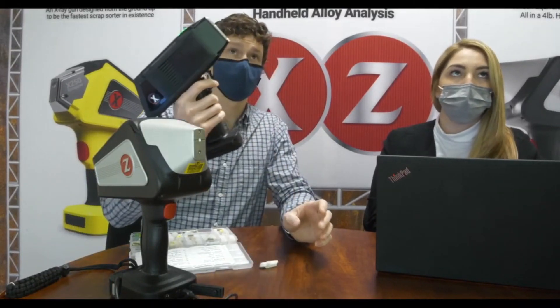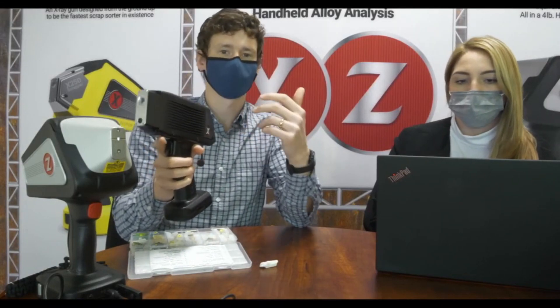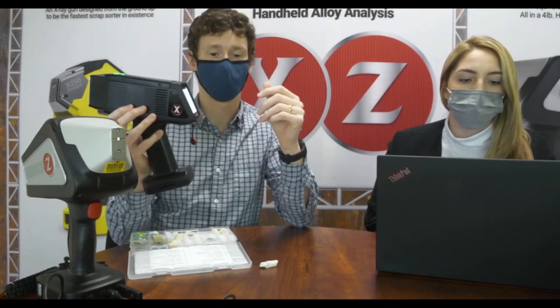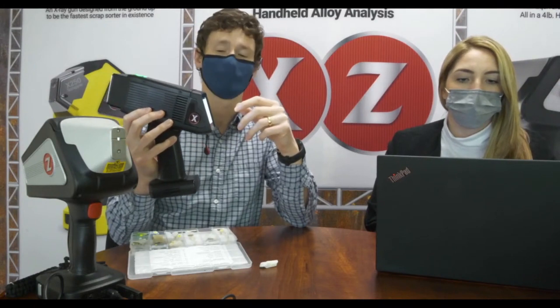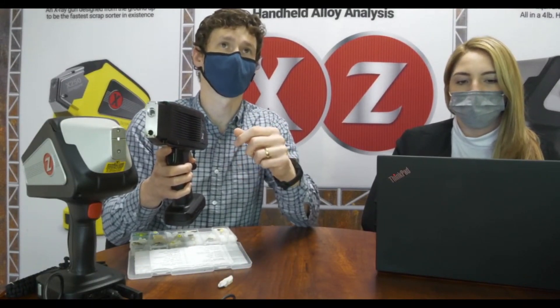So that was LIBS — a laser-based optical emission technique that can see even very light elements like lithium, hydrogen, and oxygen. This is XRF, and the lightest element this model can pick up is magnesium. The nice thing about XRF is that it's much less dependent on empirical calibration. We ship this model with a really nice factory-built calibration that should do quite well on almost any geological matrix, so right out of the box you can get pretty good quantitative results, which you can optimize further if needed — though a lot of people find they don't have to.